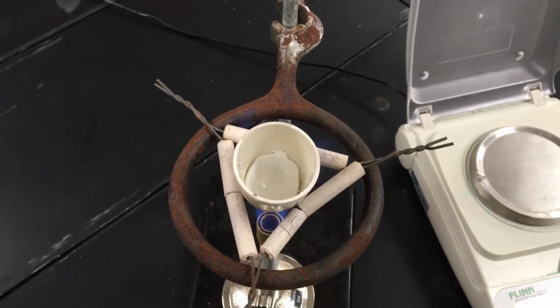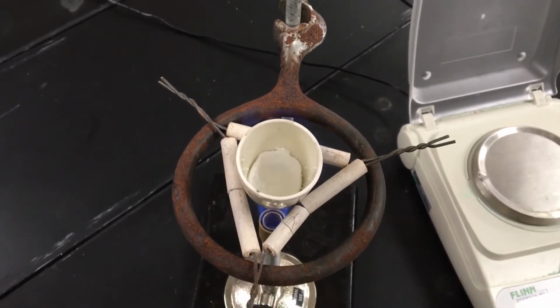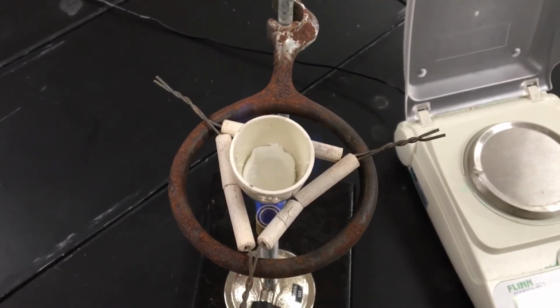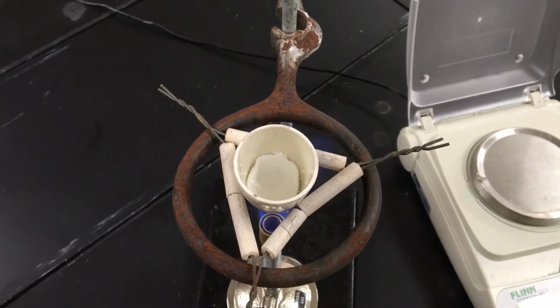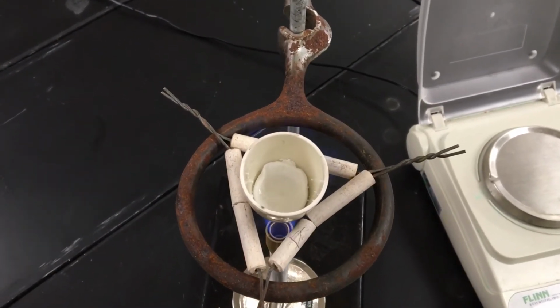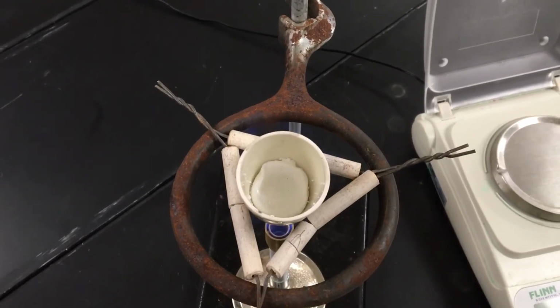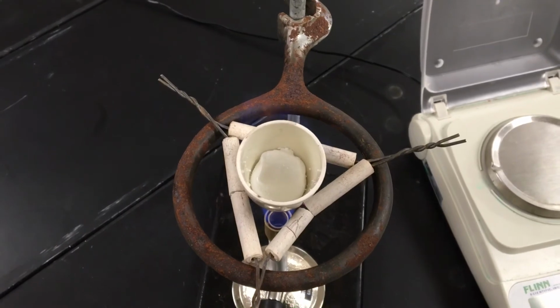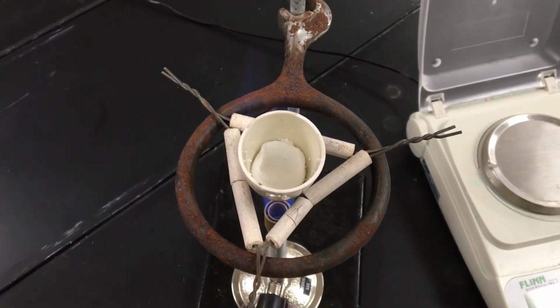moles of water. You can see that the sample is slowing down, and as more and more water is removed, it is becoming, well, more anhydrous. So I'm going to let this run for a few more moments, and then I'll take a few measurements, and then you can perform the calculation portion.